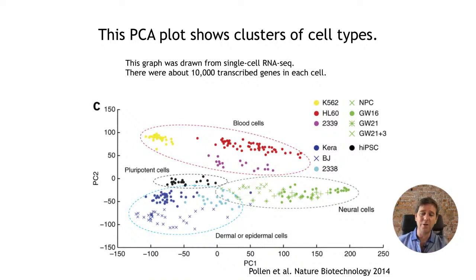So Josh, when he talks about this, shows this single cell RNA-seq data set. What's shown here is a graph of RNA-seq data. It just happens to be single cell data in this case from quite a few years ago. But there's 10,000 odd genes in this data set, so that would be the rows in the original data set. And there's counts in the different columns, different things that they're observing here, that they're actually studying.